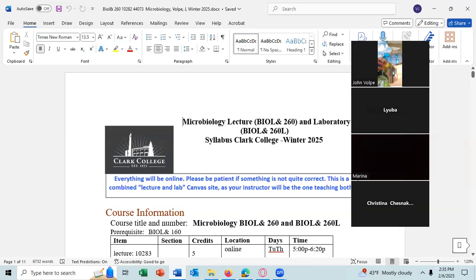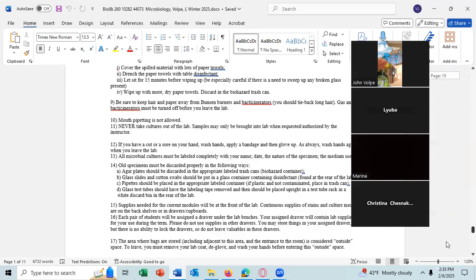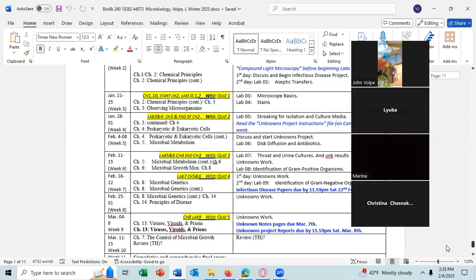All right, before we begin, are there any questions? Today is February 6th, and we are supposed to be covering Lab 6 on disc diffusion and antibiotics. Any questions about any of that?